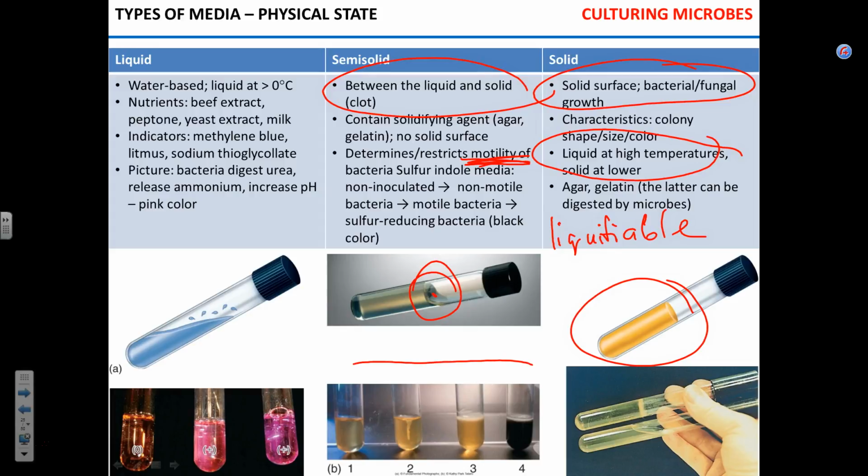So this is the example here. So this is your control. Transparent, semi-solid medium, nothing happens. You inoculate it with a non-motile bacteria. You see that trace going down?